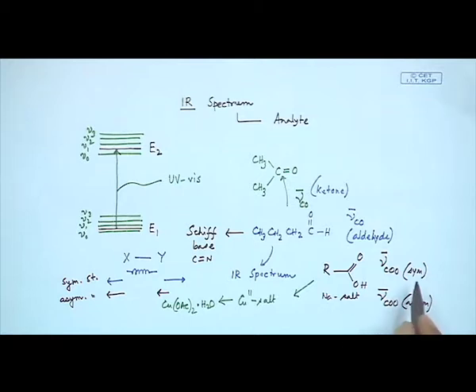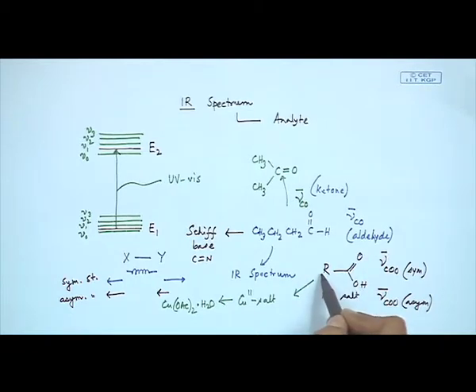Comparing the free acid and the sodium salt, we can have a different type of stretching frequency for the carboxy function. That not only tells us what sort of bonding is present between carbon and oxygen and carbon towards the alkyl function, but if new coordinate bonds are forming, the nature of this coordinate bond can also be found out by looking at the corresponding IR stretching frequency for this CO and this CO and this CC, because these will all be changing.